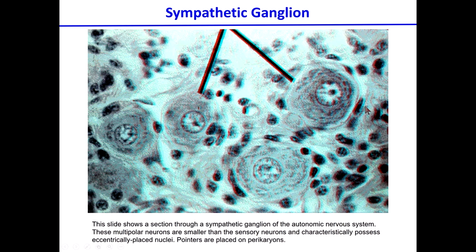This is a ganglion. As you can see, it resembles very much one of the diagrams that I showed you at the end of the second lecture earlier today. You can see all these protective cells. Some of them will be the Schwann cells, indicating the nuclei, and then you have some of these nerve cells with the proper characteristics.